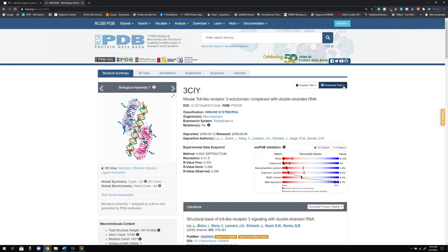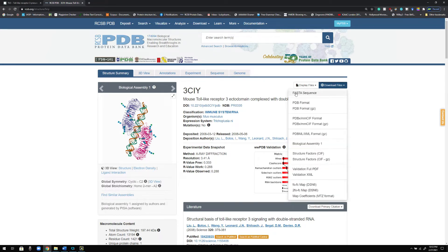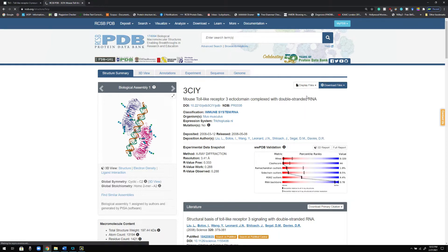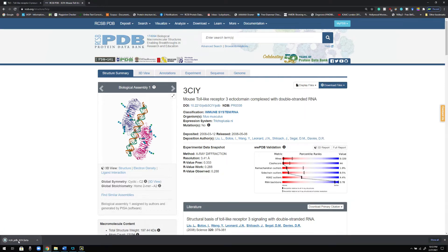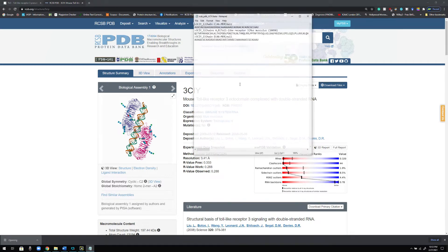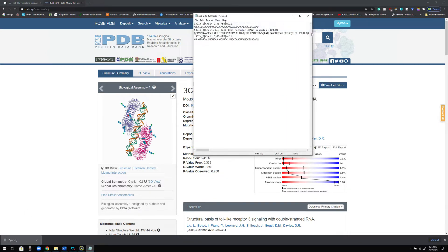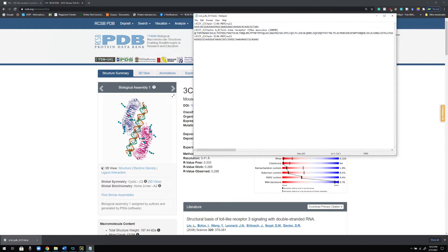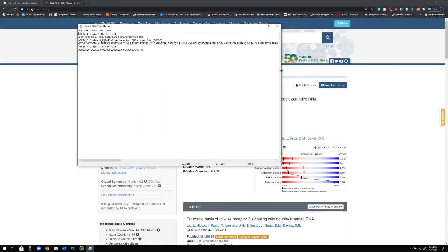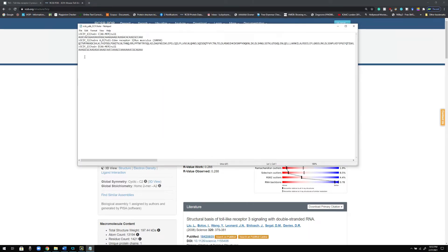What you can do is extract the FASTA sequence right away from the PDB page — it's very easy. You click on the download button and you will see that the FASTA sequence is getting downloaded. This file shows you the whole sequence: you have the sequence of the RNA molecule and the sequence of the protein.